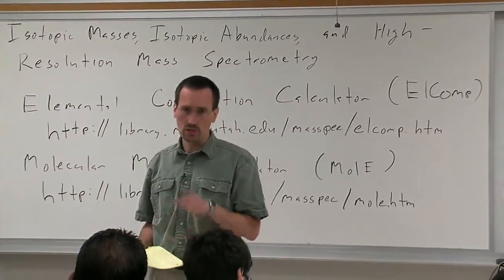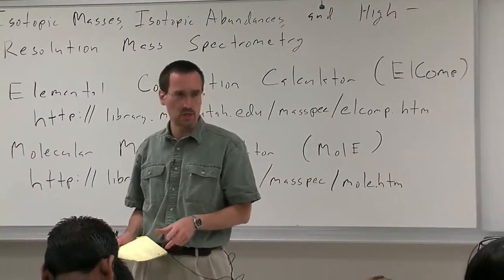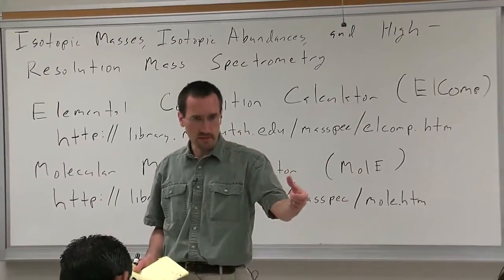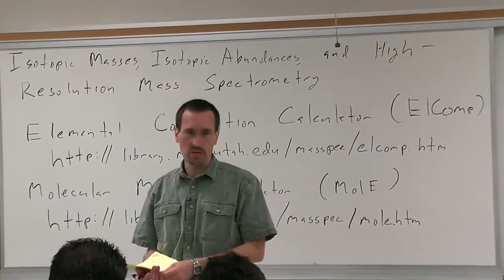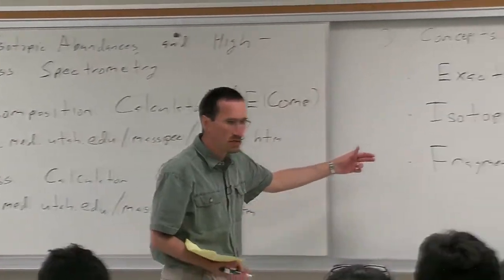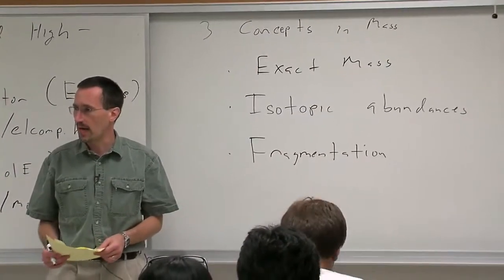And that's essentially just protic acid chemistry. What we saw was a reaction that involved a leaving group, a protonated nitrogen leaving. That's chemistry that you've really been used to since your sophomore year. But when we talk about fragmentation in EI mass spec, we'll be talking about fragmentation of radical cations.